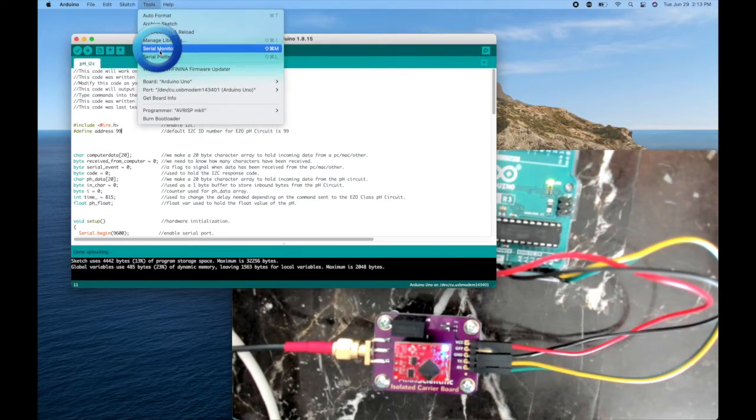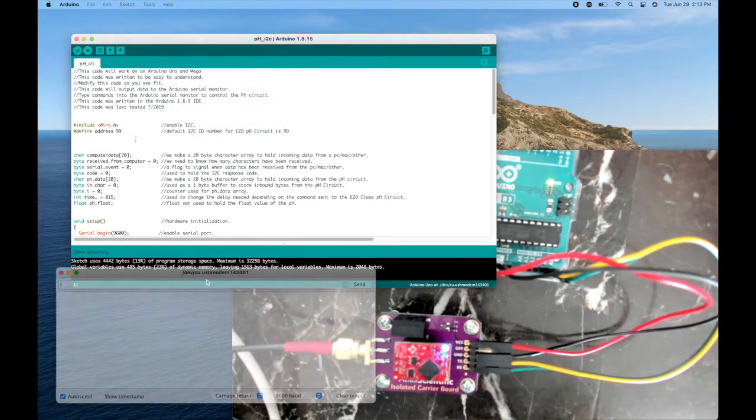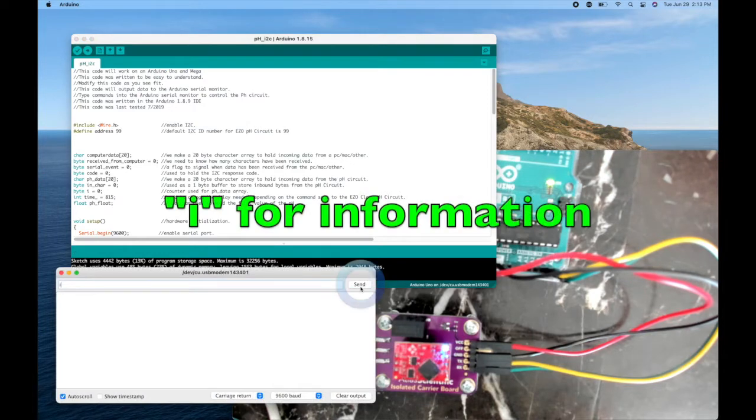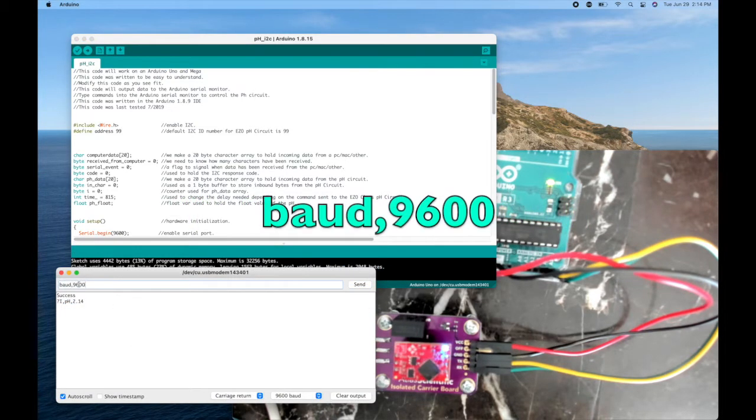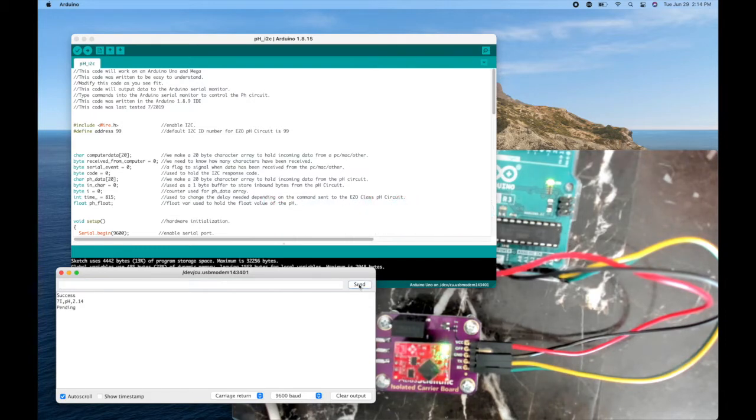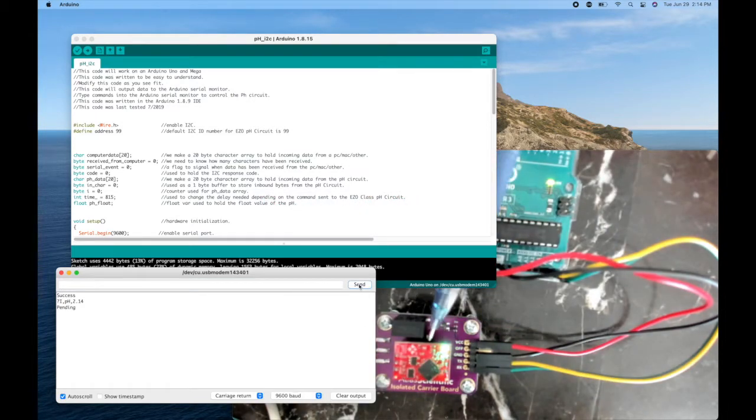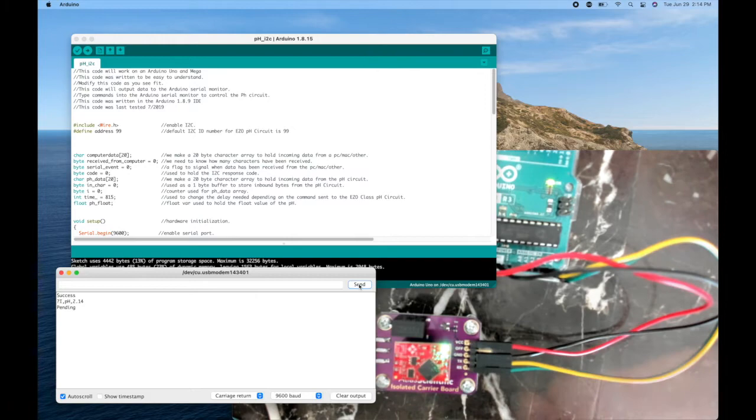We'll open the serial monitor, type I. Okay, we have access to it, and now I'll type baud comma 9600. I'll send that, and it's just switched me with the green flash over to UART mode.